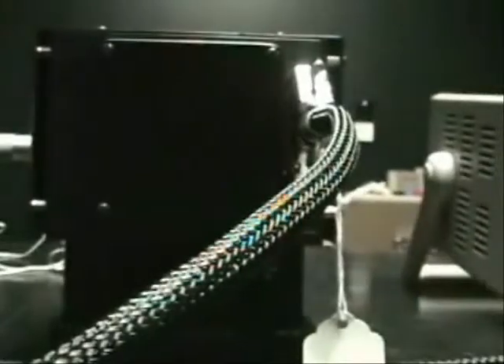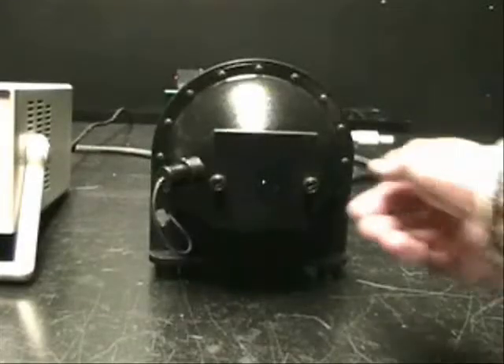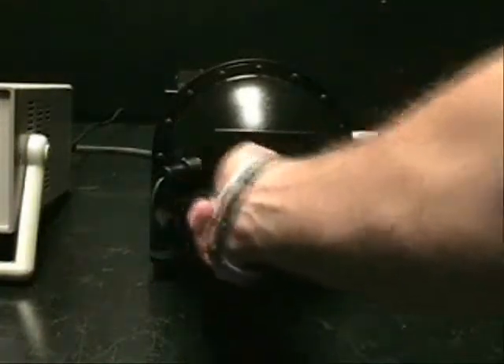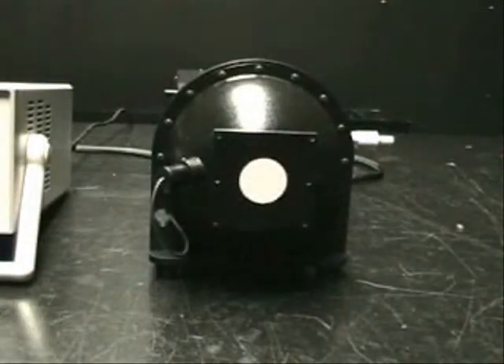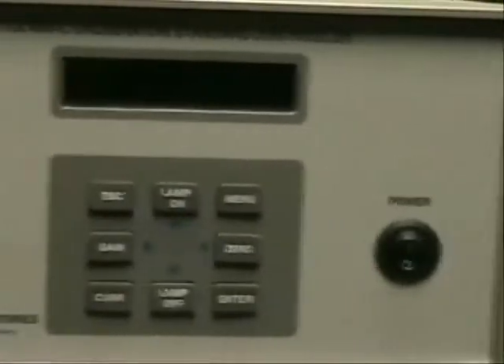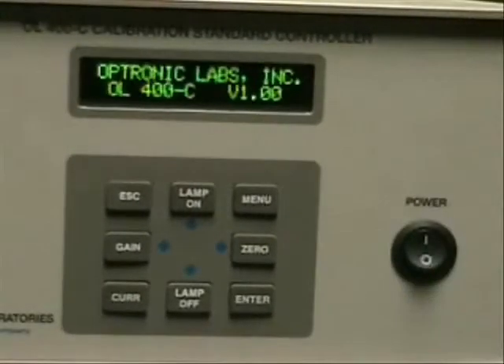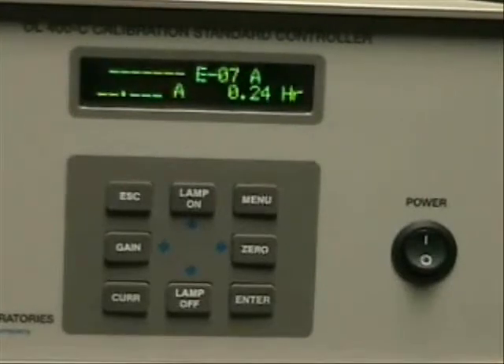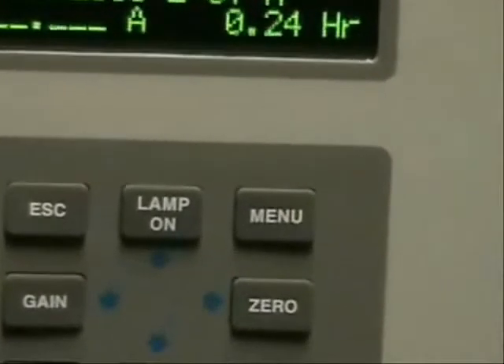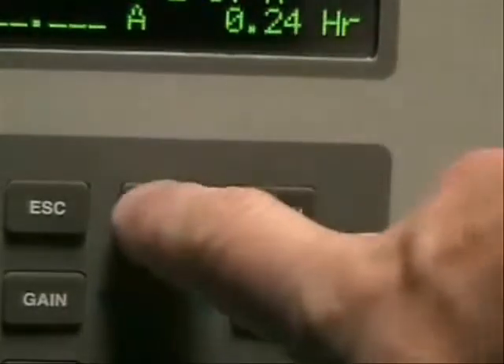Now we'll move to the front of the unit and power it up. The first thing you want to do is open the port, remove the cover, and expose the entrance port. To power the unit, simply turn on the power button. To power on the lamp, we have a lamp on button — go ahead and press it.